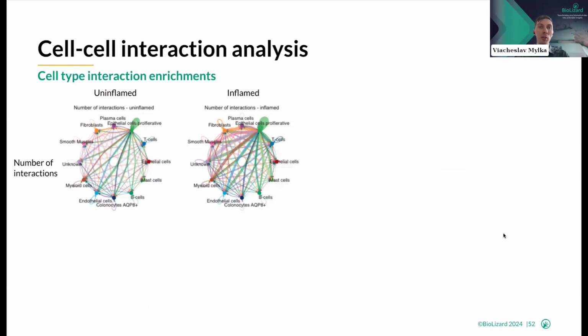Enough about spatial niches. Cell-cell interaction analysis is another very powerful tool, which we used also in the single-cell RNA sequencing field. But there we were inferring those interactions. So we know ligand and receptor expression, but we don't know the location of cells, right? Because the tissues are homogenized. While here we do know the location of cells within tissue because the architecture of tissue is preserved.